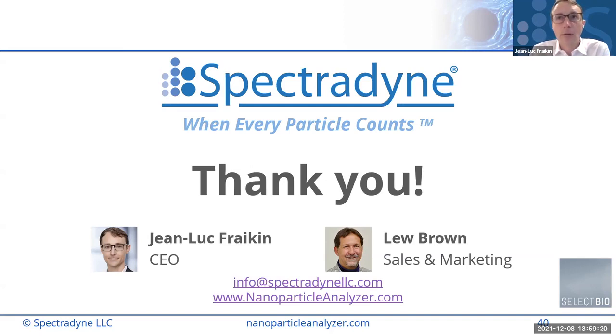And those samples did have a peak, so maybe the polydispersity index was low as a result. But there's a lot of wiggle room in what that number really means and what it really represents about the sample, right? Again, you can't use it to convert to a real particle size distribution because it's not a well-posed problem, even if the number is low.